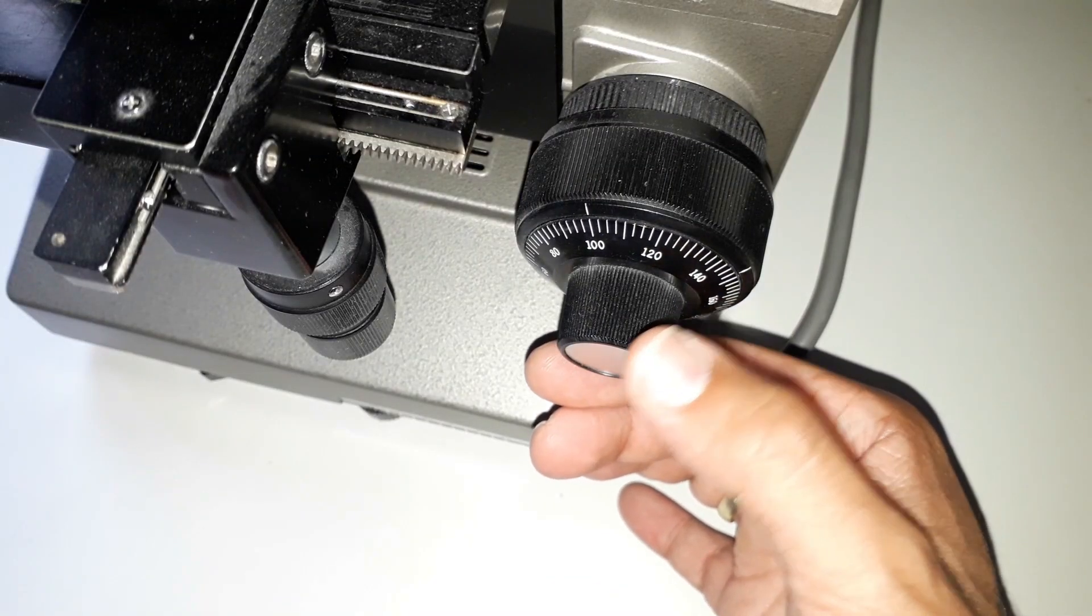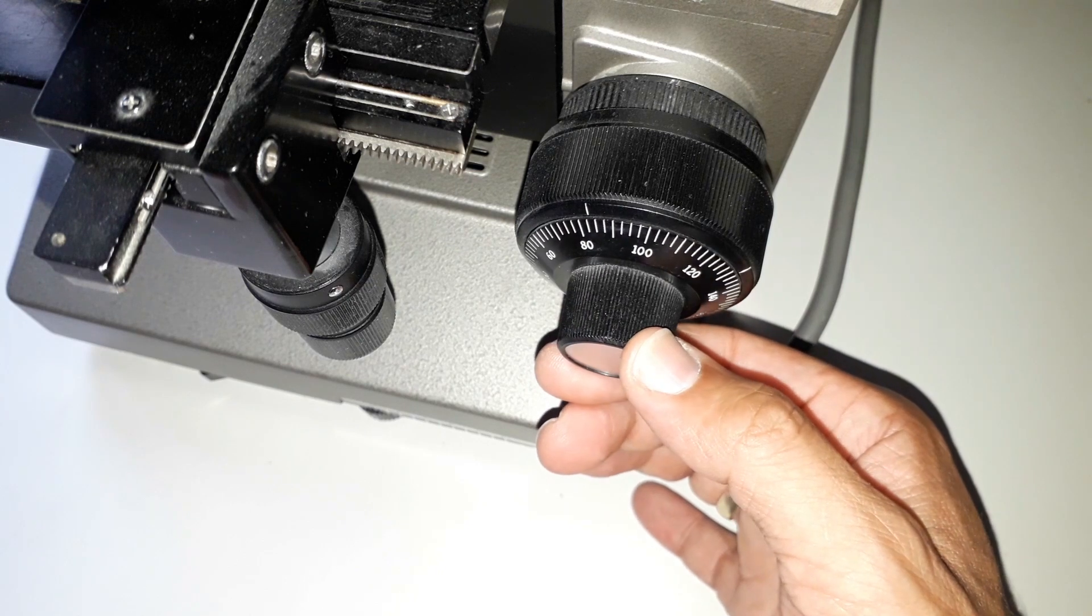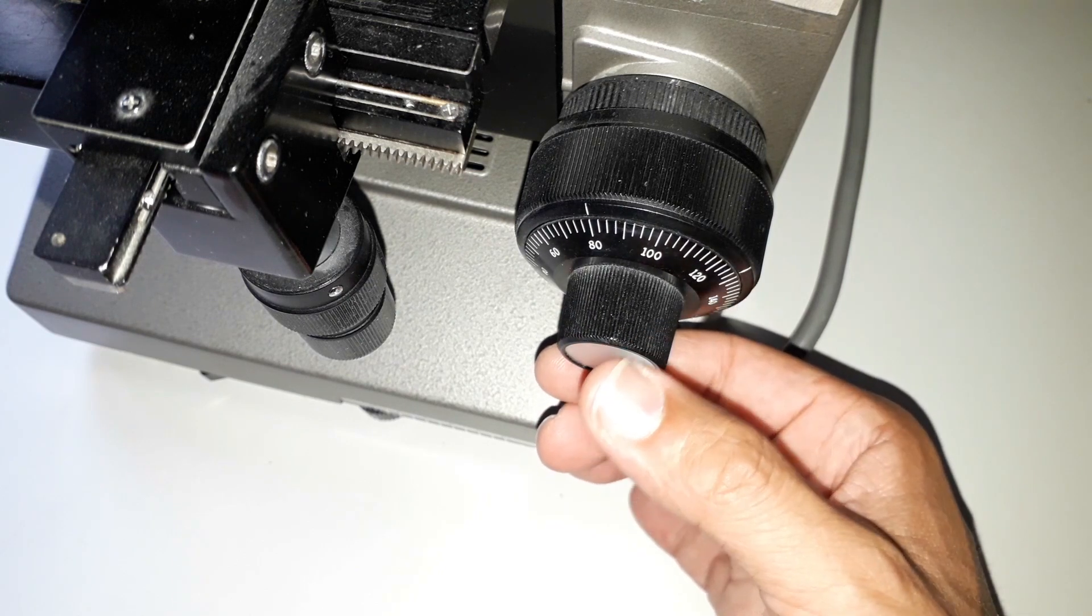So you have a whole range of let's say 25, 30, 40 different images depending on how thick your specimen is and all of them are sequentially numbered that is really important and all of them are arranged in such a way that the top or the first image has the top part in focus and the last image has the bottom part in focus.